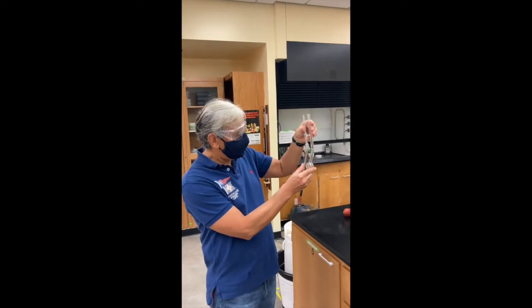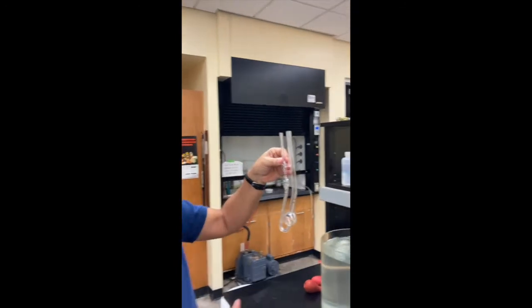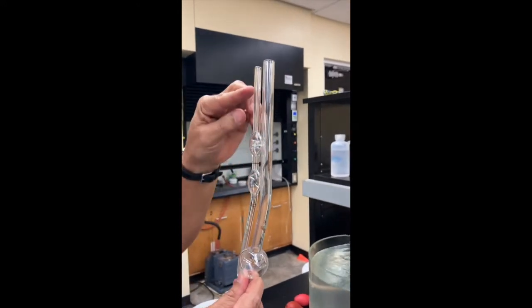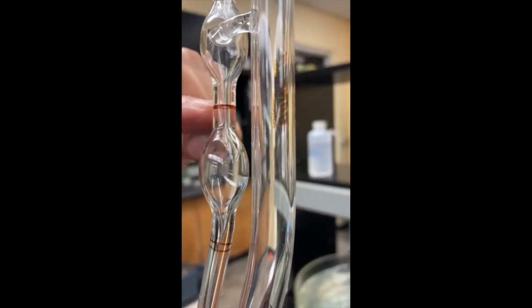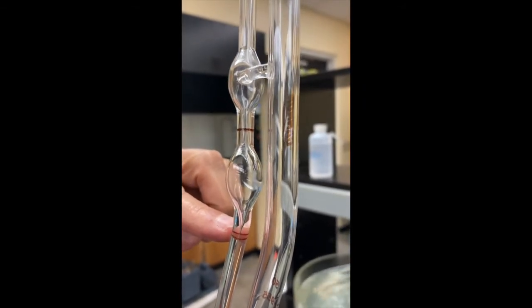Okay, this is the device called a viscosimeter, also called an Ostwald viscosimeter, and it is used to measure the time the liquid flows between these two marks. They are called fiducial marks. This is the upper fiducial mark, and this is the lower fiducial mark.